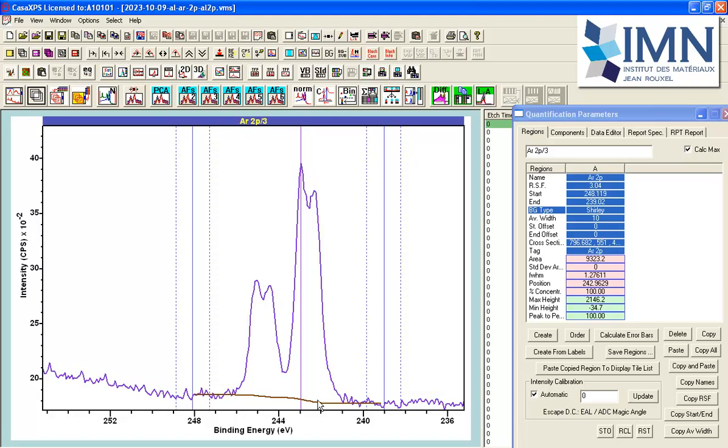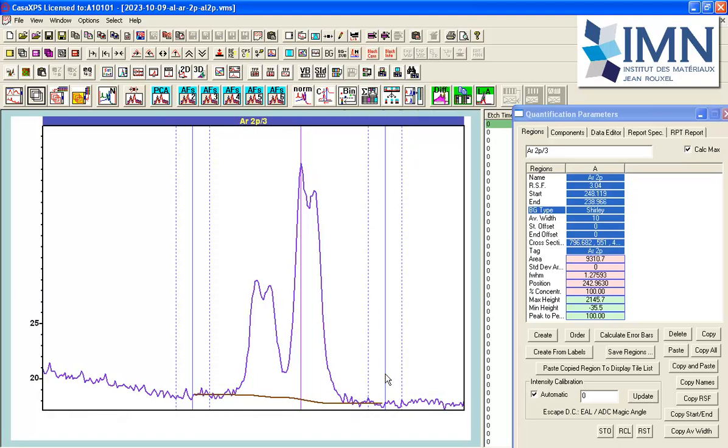So this is the start and this is the end, and pretty much the use of 10 data points, provided it doesn't cause the range of signal to go into the peak in some way or some sort of structure, that 10 data points either side of the datum that would otherwise be used to calculate the background, that gives a reasonably stable background calculated across data such as these.